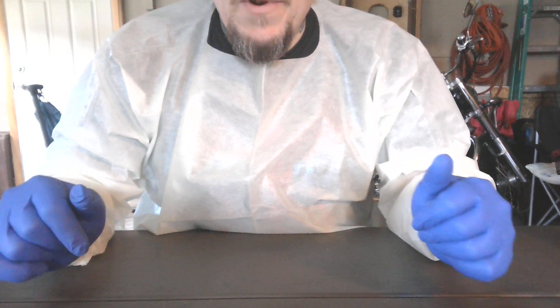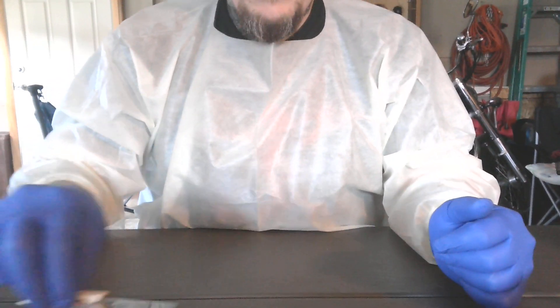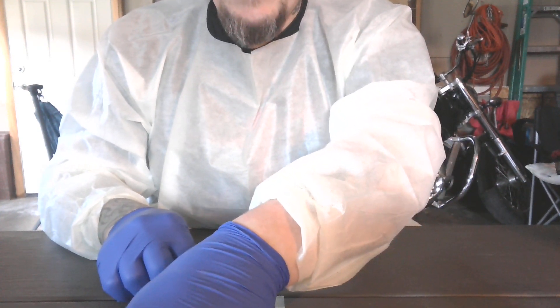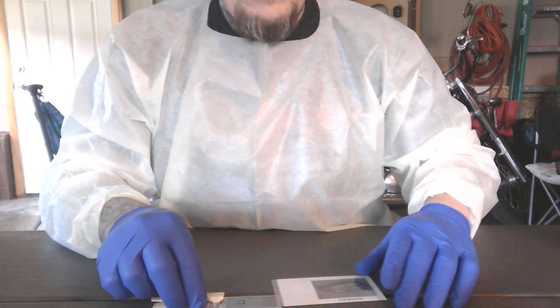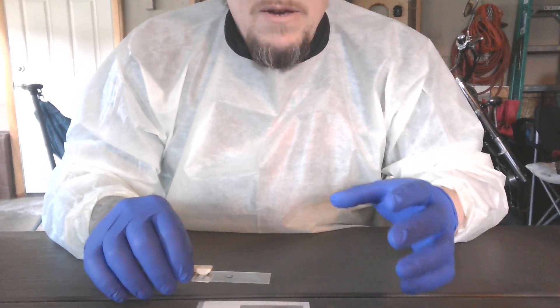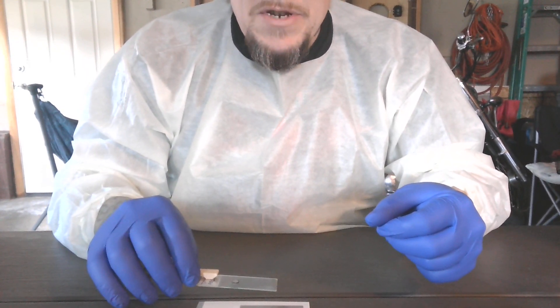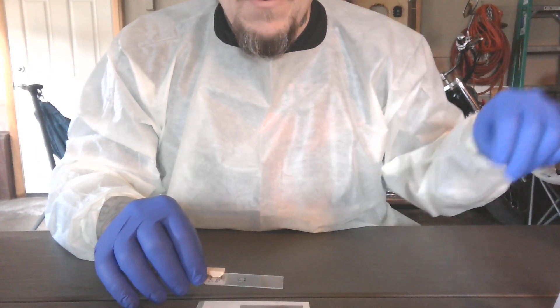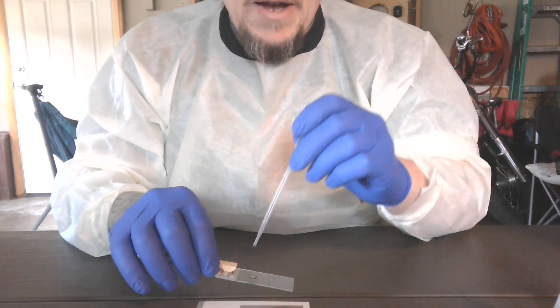Now your area is ready to work. So you're going to get that slide that we just heat treated. You're going to get your staining tray. The smear that we prepared is facing up. You're going to angle that down just a little bit, and then you're going to place several drops of the methylene blue directly onto the smear.